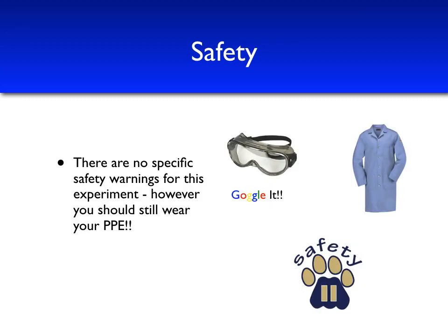Here's our safety pause for today's experiment. Fortunately, there are no specific safety warnings for this experiment. All the reagents are safe or have low hazard associated with them and can be safely rinsed down the drain with plenty of running water. However, in all experiments, we do want to make sure we wear our lab coats and our safety goggles.